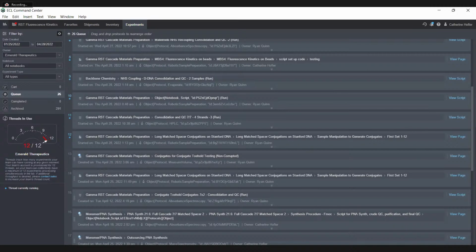Well, I did something similar to this ages ago with an old Bruker NMR, and I had to program it with a paper tape to run a series of experiments overnight, changing various decoupling frequencies and so on. It took me forever to get that tape written and get the experiment to run beginning to end without failing for one reason or another. This automation is spectacular. This is a whole lot more impressive than the Zymark robotic system I helped build at a pharmaceutical company years ago. I've never built anything like this, but I'm still impressed.